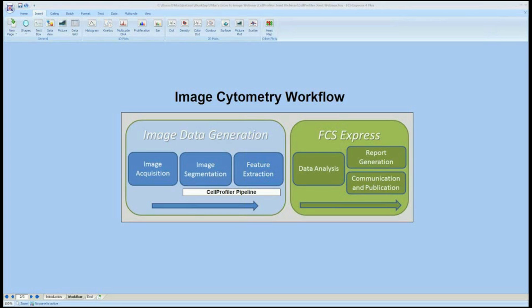And then within CellProfiler, in this example, you would set up your image segmentation, your thresholding, and your analysis, where you would generate objects and information about those objects. So that's feature extraction. And at that point, you can save out what's usually called a data set or a multi-parametric data set that has the object list and the variables that are measured. And oftentimes you save out segmentation maps and image analysis maps along with your original images.